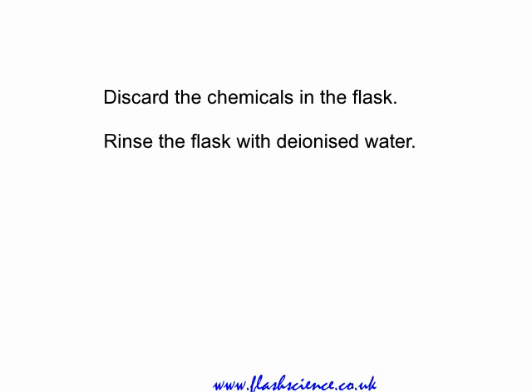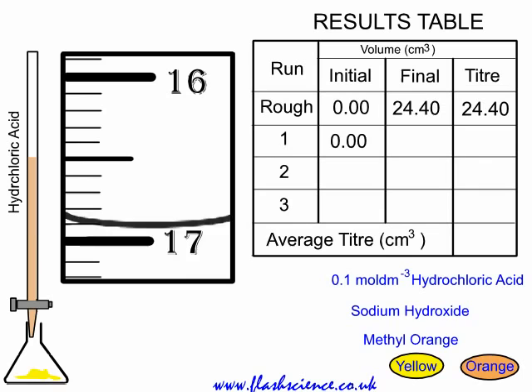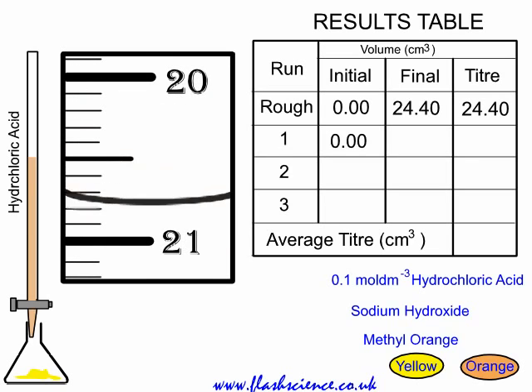We're ready now to begin the accurate titer. We've got a good idea of where the endpoint is. You discard the chemicals in the flask and rinse it with deionized water — it doesn't matter if there's a little bit of water left. Fill the burette up and record the initial reading. You know it's going to take at least 22 or 23, so rush in the first 22 or 23 cubic centimetres. Then slow down and add it drop-wise, even half-drop fashion, using a wash bottle to wash off the half-drop from the jet below the stopcock.